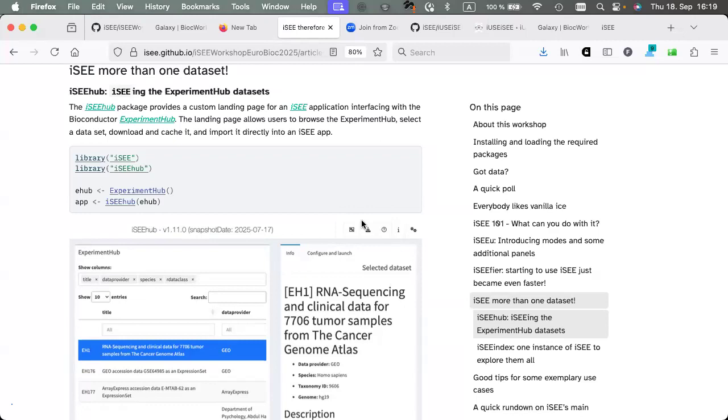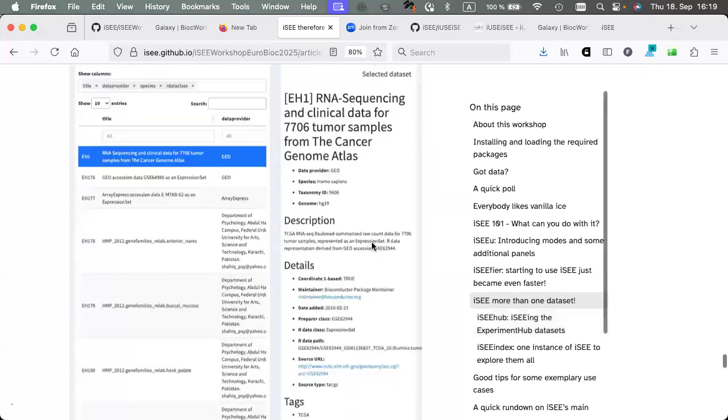You say, not just that the data has been deposited to this or to that repo or to Zenodo, or as a cell by gene instance, the cell by gene team will say, oh, Jesus, this is something that our tool cannot do. And I say, well, that's why you do this and we do that. So you can actually say, has been deployed upon the local instance of your Shiny server and so on and so forth, and that's it.